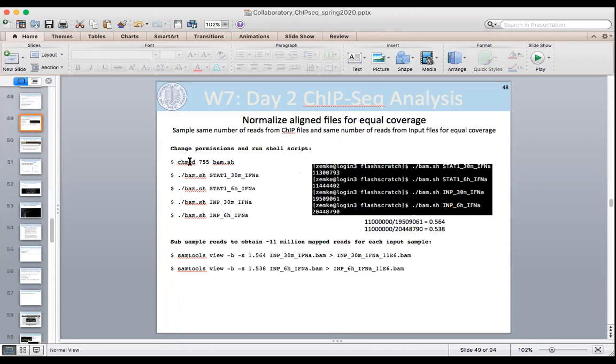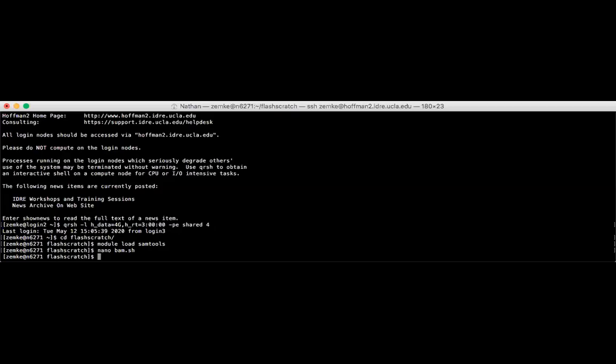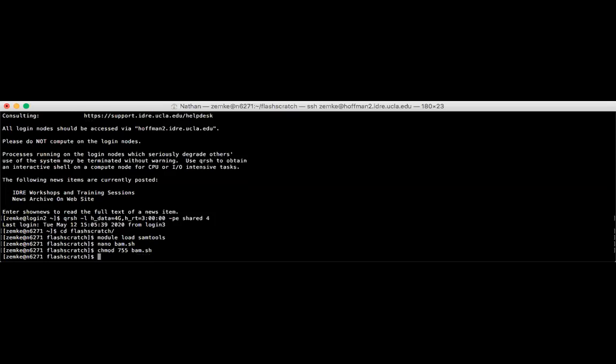By default, it won't be. So I'm going to go back to terminal. chmod 755 bam.sh.